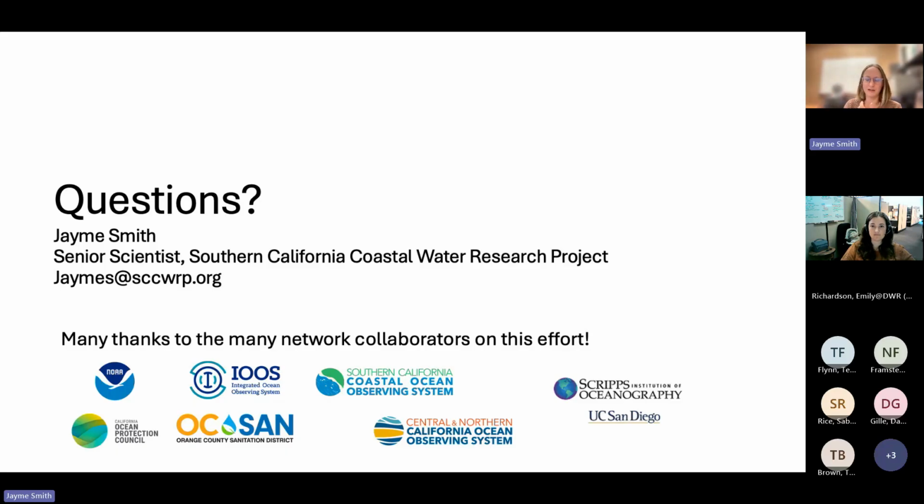So I think it would be similar to what you're seeing with the inflow system. Depending on how you deploy it, you are aware of that and you're like, okay, I'm seeing fragments. Also keep in mind that you can't always fit the whole chain in the field of view. You see a maximum of maybe 5 cells, and I know from microscopy, looking with a dissecting scope, that they can get longer than that. But you do get some fragmentation.